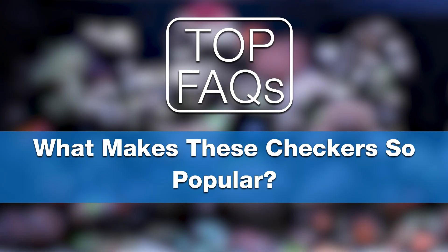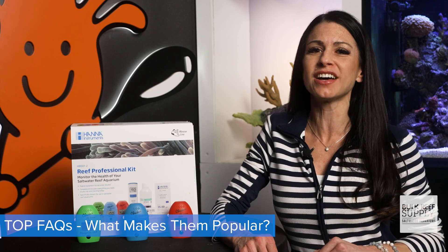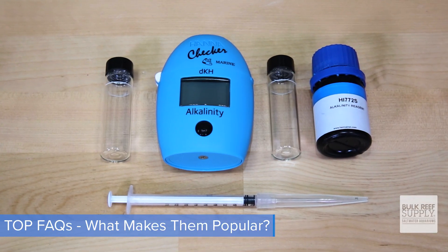Search the forums, ask around — with five out of five stars and thousands of reviews, hands down 100%, basically everyone who's ever used a Hanna checker absolutely loves it. And here's why: they're quick and easy to use, they're easy to read, and you get reliable results. So I believe it's safe to say that once you go Hanna, there's no going back, because yes, they really are that awesome.